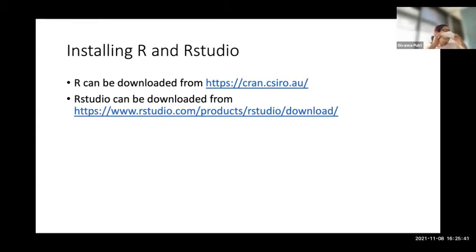I can remove this. Sorry, I'm just removing my mouse so it's a bit easier.